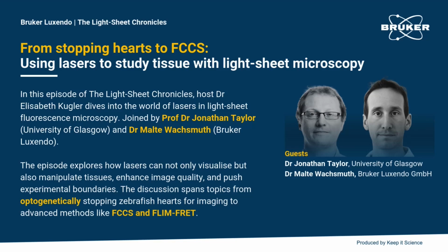Yeah, so like you say, a key challenge in biology is to separate cause from effect and understand what's happening through the process and not just imaging the final result. And of course, this ability to understand the time domain is the whole point of doing live imaging, such as with light sheet microscopy, seeing how things change over time to better understand the causality and the mechanisms behind what's happening.